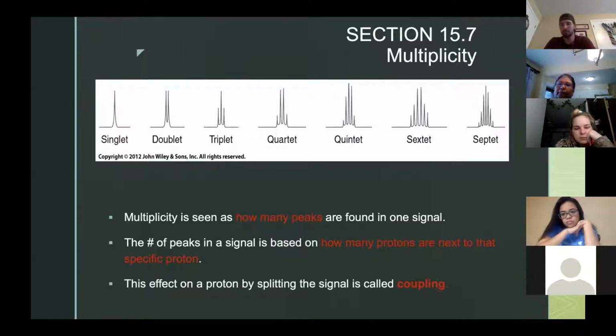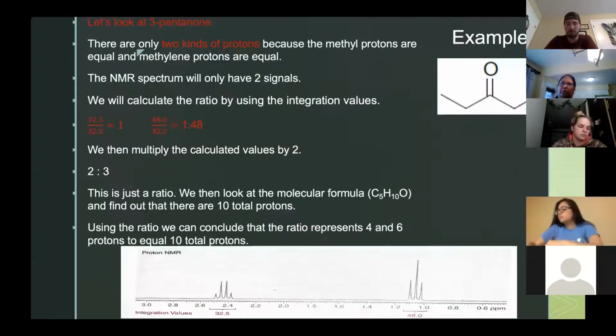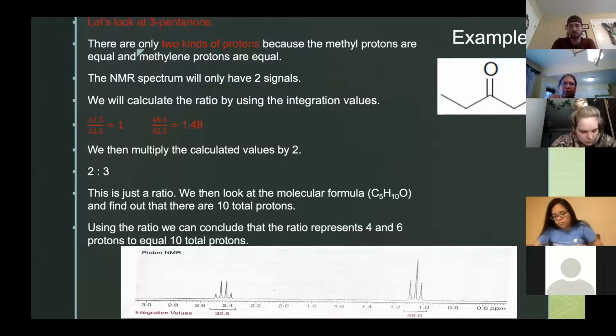Yeah. Okay, so you were talking about area underneath peaks and stuff. I remember I talked about something similar to that in my gas chromatography presentation. Is this also similar to that, where you're using integration values to account for sensitivity in your equipment? You do, but who did the presentation? Was it Jamie again, or was it Rebecca? I don't remember.